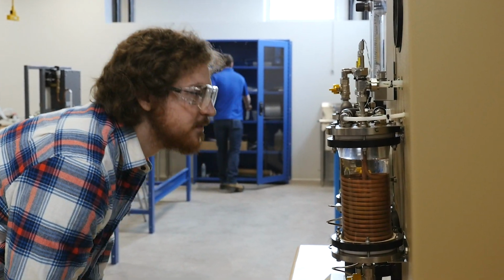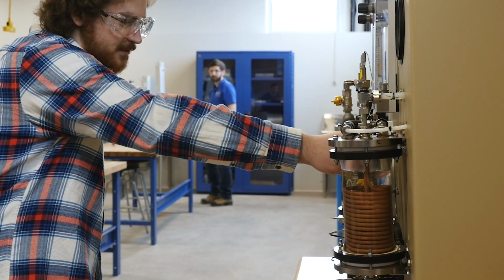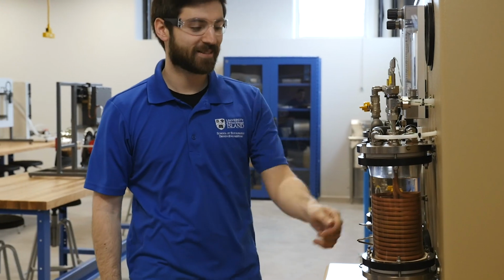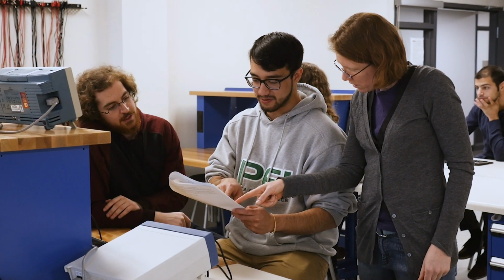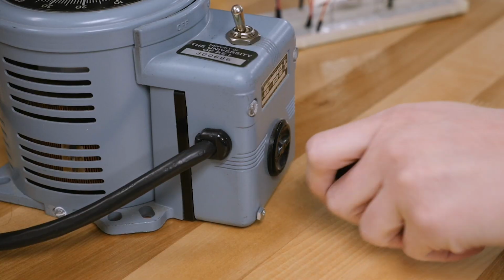Do not touch any equipment in the lab other than that which your instructor has given you permission to use. Only do activities when you have been authorized to do so by your instructor. Ask for help before starting any activities that you are not fully familiar with and that might pose a hazard to yourself or others. Check your equipment before using it.